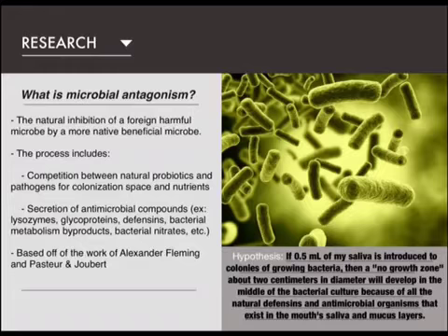This experiment was based off of Fleming's experiment where he introduced his mucus to a colony of bacteria, and this led him to discover the world's first antibiotic. Pasteur and Joubert introduced a series of experiments where they observed bacteria versus viruses and other bacteria.